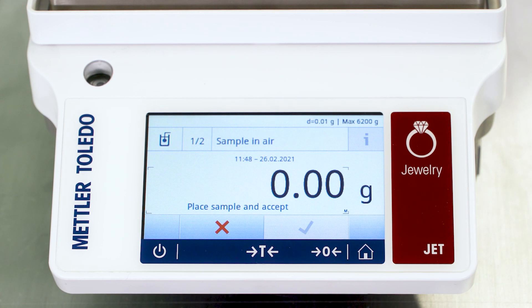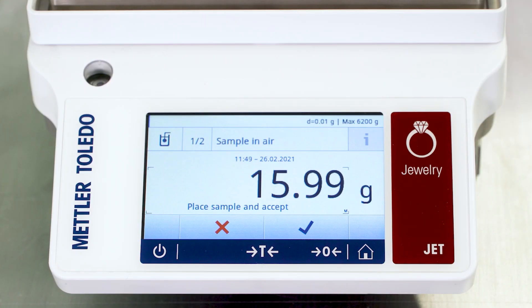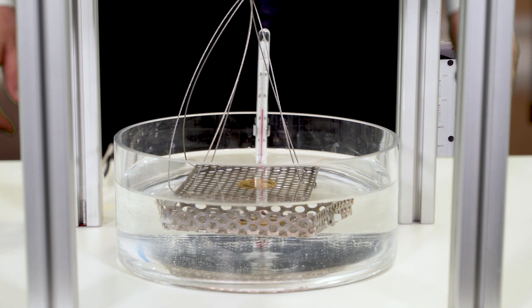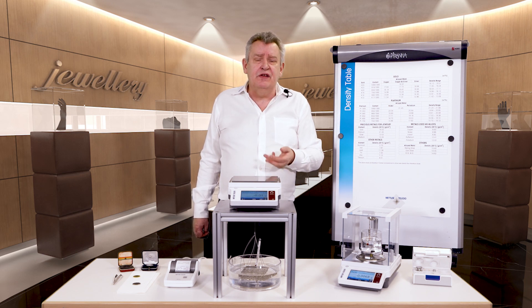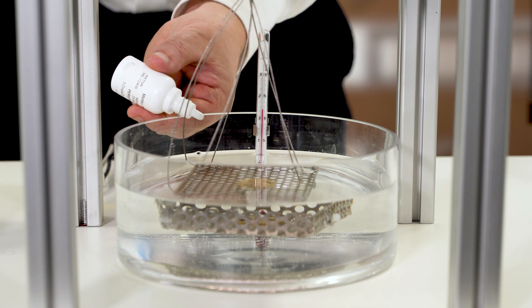The balance asks me to weigh the sample in air. I make sure the balance is leveled and the display shows zero, pressing zero if necessary. I place this gold coin in the middle of the weighing pan and press the green tick mark to enter that result. It now asks me to immerse the sample — using tweezers, I carefully place the coin on the homemade platform immersed in the liquid, which is water in this case, and press accept. It is important to make sure there are no bubbles on the surface of your sample, as bubbles could lead to measurement errors. We can use a small dose of soap to remove bubbles from the water.